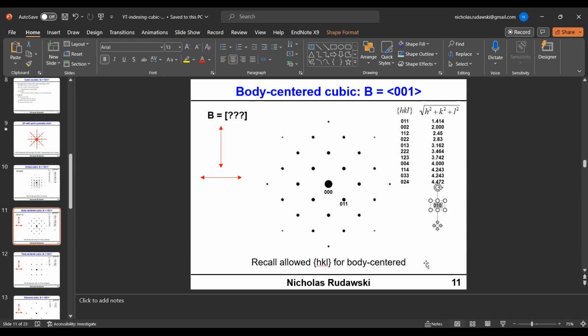So then what are our indices for this other spot? Well, the easiest answer, I was going to say 1, 0, 0, but that wouldn't be consistent, right? It has to be in this family. So let's do 0, 1 bar, 1. That gets me a 0 dot product.